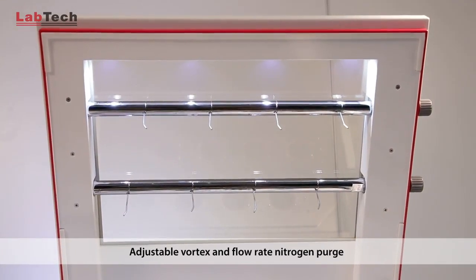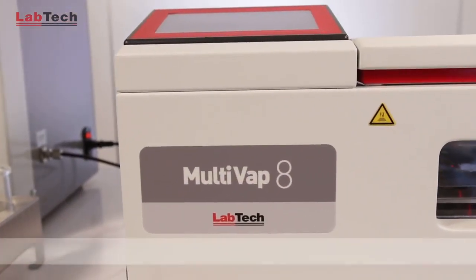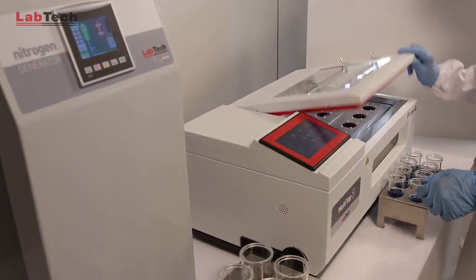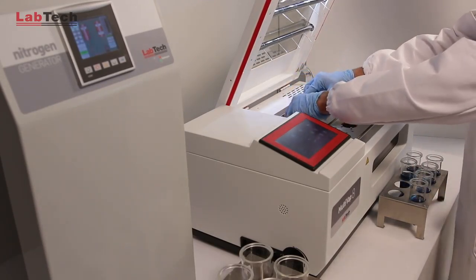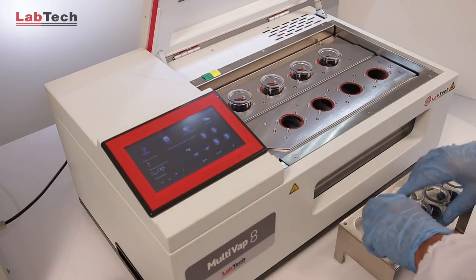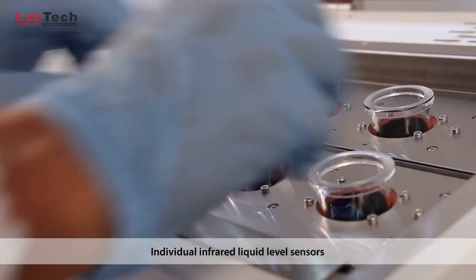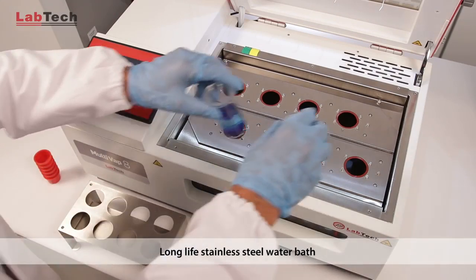Both the vortex and the flow rates are adjustable. The process can be seen via the front window.